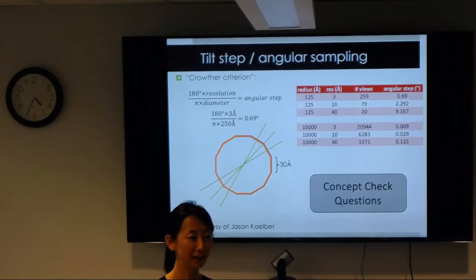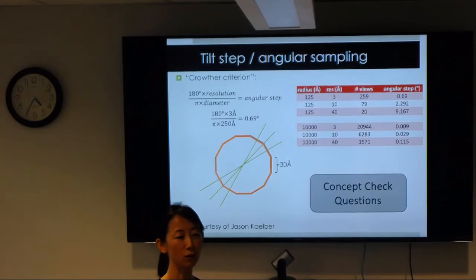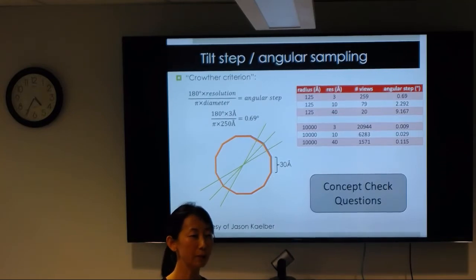Contamination, and then temperature goes up, and your grid is not good anymore. Or you bend it. You puncture a hole right across your square using your tweezer. Or you can't find it afterwards. So there are many issues. But nowadays, it's not that difficult anymore. I think the microscope here, as I said, you can just use a one-click button. Finding it still probably takes some effort, but technically speaking, it's not as challenging as before.